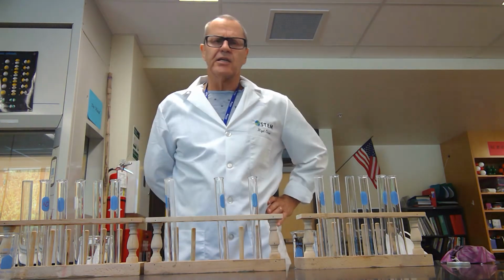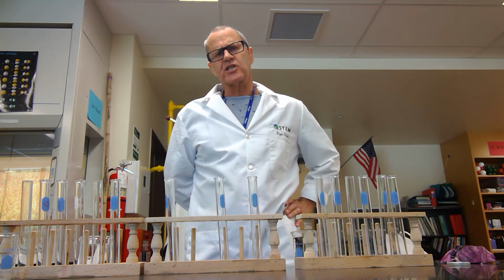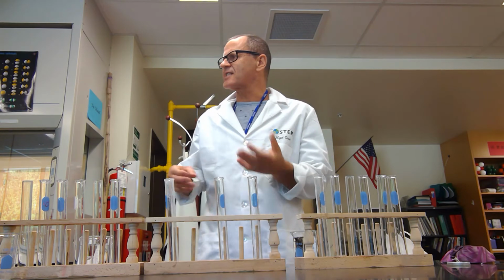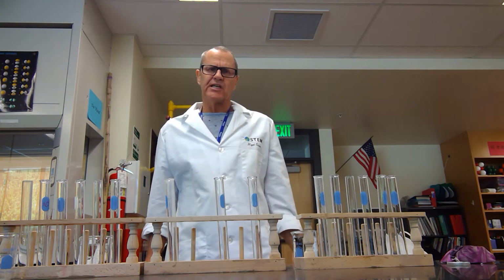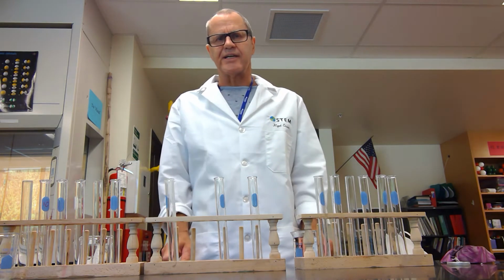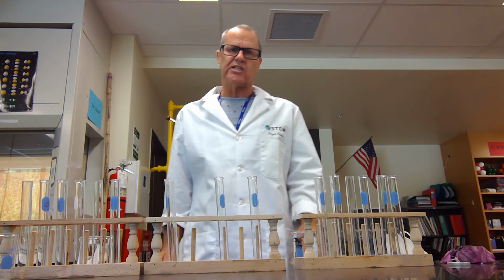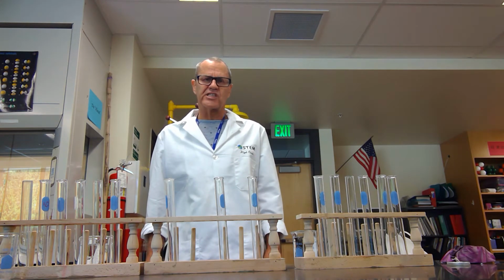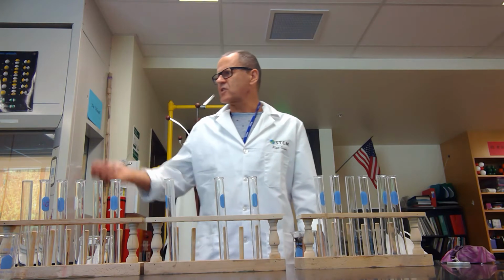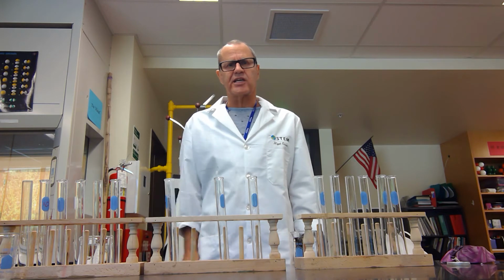So that is a collection of organic compounds, that red cabbage. And that collection of organic compounds has some that are pigments. And pigments basically reflect light at certain wavelengths. And when environmental conditions, such as pH, change, then they reflect light in a different manner. And therefore, we're going to see a difference in the colour of that indicator that is in the cabbage.